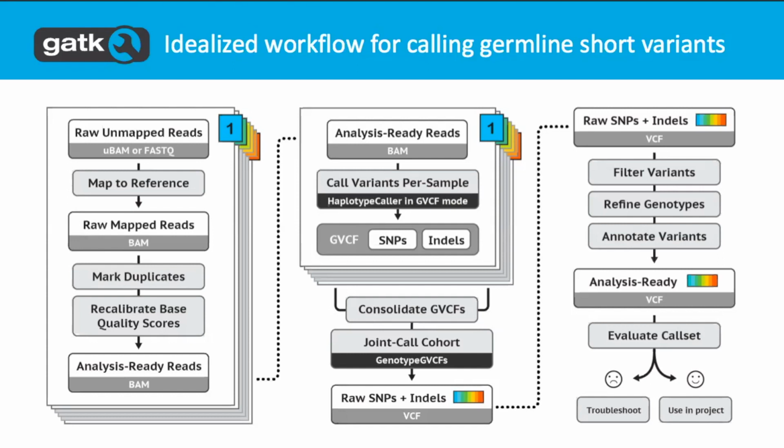Yeah, so the biggest difference that you get is in the single whole genome case, where VQSR doesn't do well, and there it's still a few percentage points, because it's always that trade-off between sensitivity and specificity, and being able to really finely differentiate artifacts from real variants. And we just find that the deep learning approach performs better in those cases where you just don't have as much data to feed into VQSR. But these are often fairly small differences.